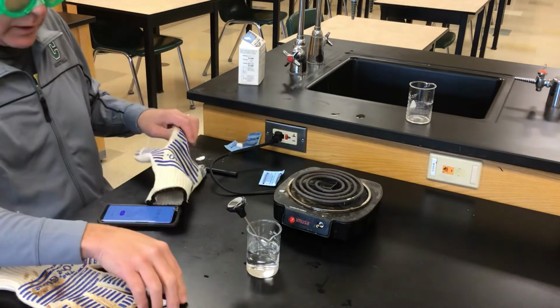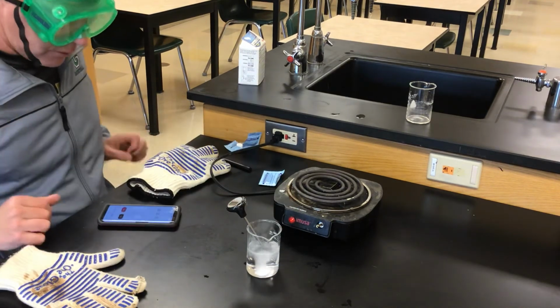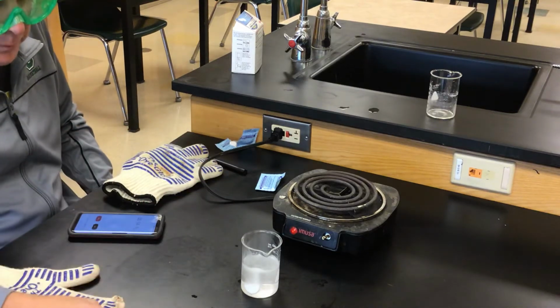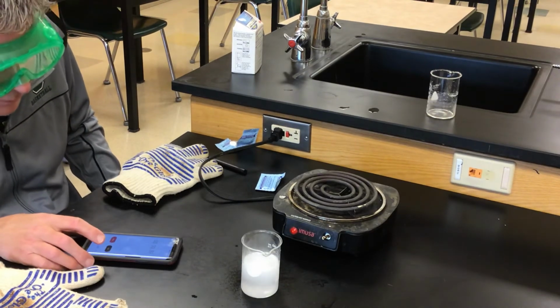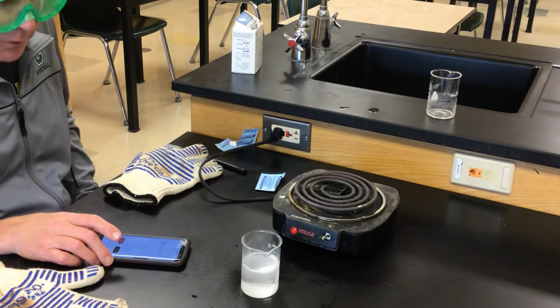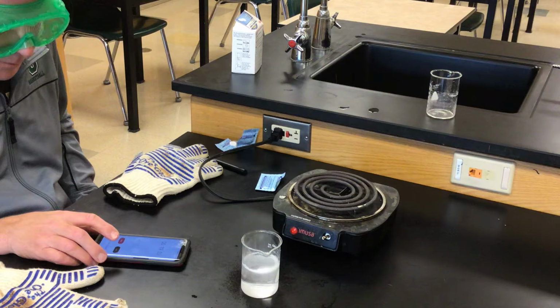This means we can drop it in and start it. I should take this out because that's a variable. And again, you can see the Alka-Seltzer fizzing pretty well there. Get data point number 3, and then we'll be done with this part of this first test in the experiment.